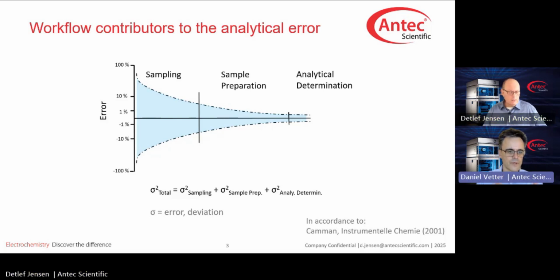So Detlef, I understood right? We take the right part of that picture. That's correct, Daniel. We will talk about the sample preparation and the analytical determination, because those two we handle in the laboratory and we have them under control, or we hope so. Whereas sampling is a completely different game.